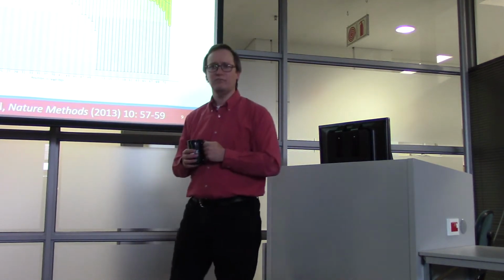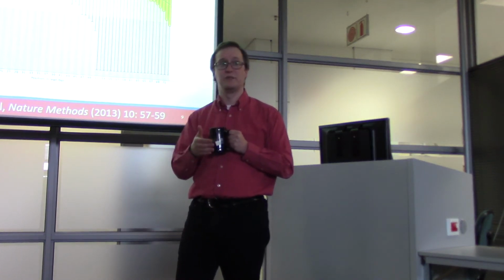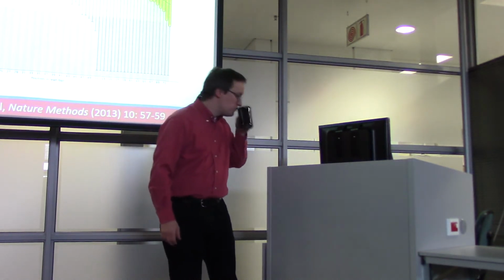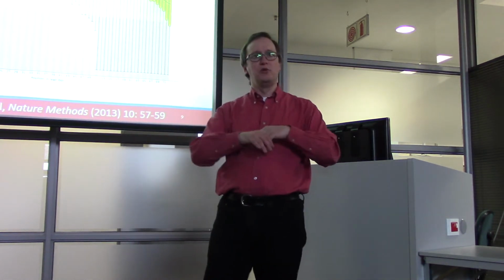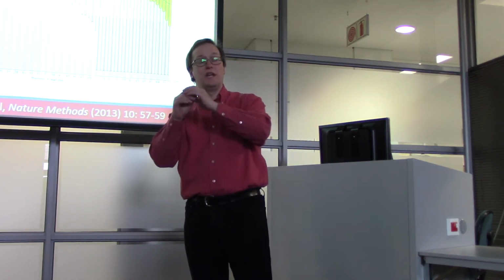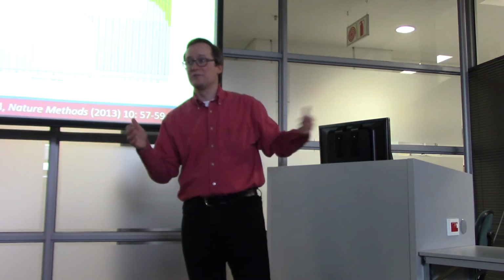Now, FastQC is one of these really widely spread tools that we use for quality assessment in these datasets. I wanted to show a plot from it to give us an example. FastQC is able to run through all the sequences in the FastQ files that we receive back, and from them evaluate how far you can go into the sequence before you start racking up huge error probabilities.